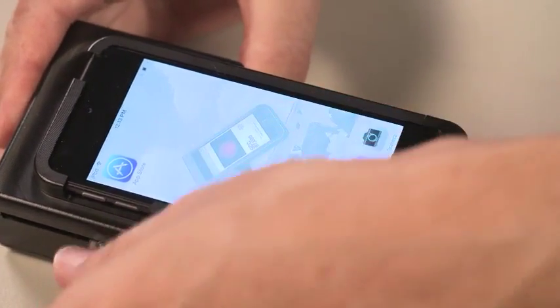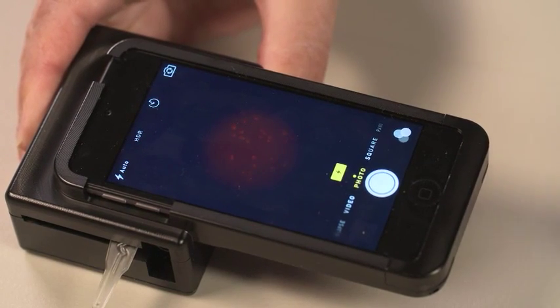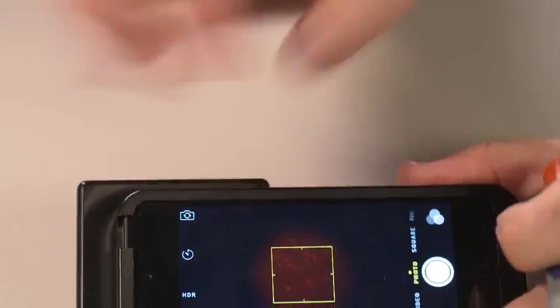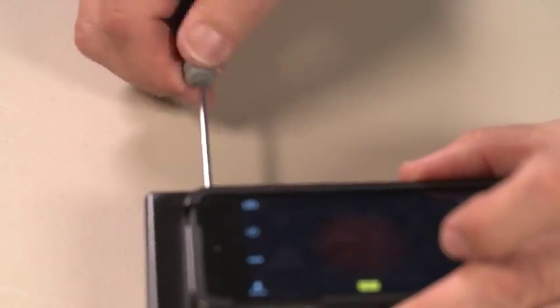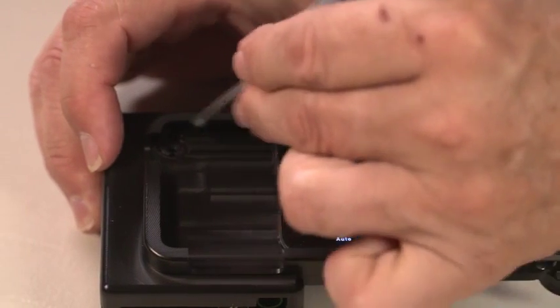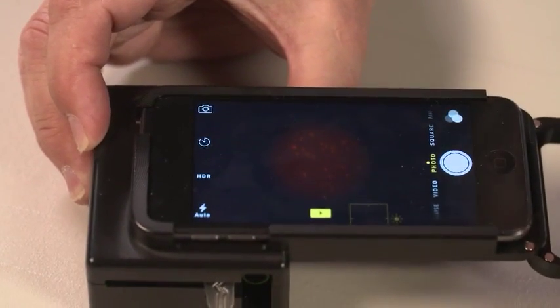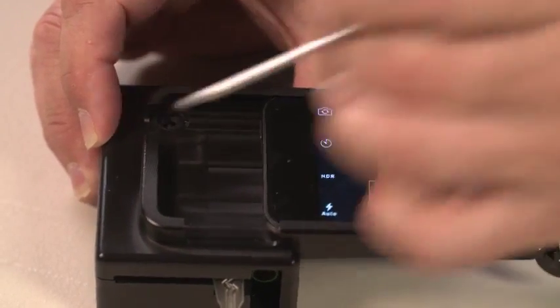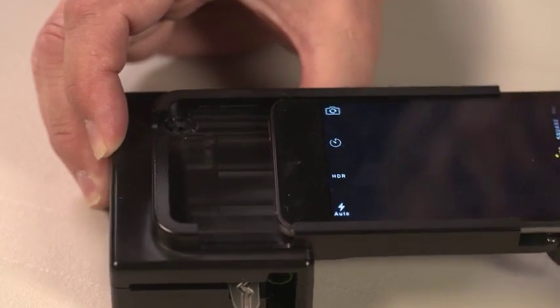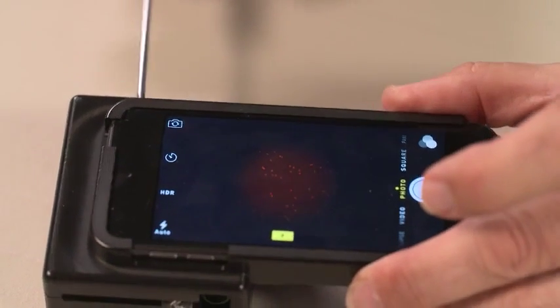From time to time, you may have to adjust the focus of the RT10. Tap the camera app on your Apple device. Make sure the slide is inserted — you are looking for clearly defined cells. If the image is unclear, slide the Apple device back from the lens. Use a Phillips or star screwdriver to loosen the screw at the side of the device. Rotate the outer ring until optimum focus is achieved. Reinsert the camera to check. You may have to repeat the process until you get a clear image. Tighten the screw on the side when complete.